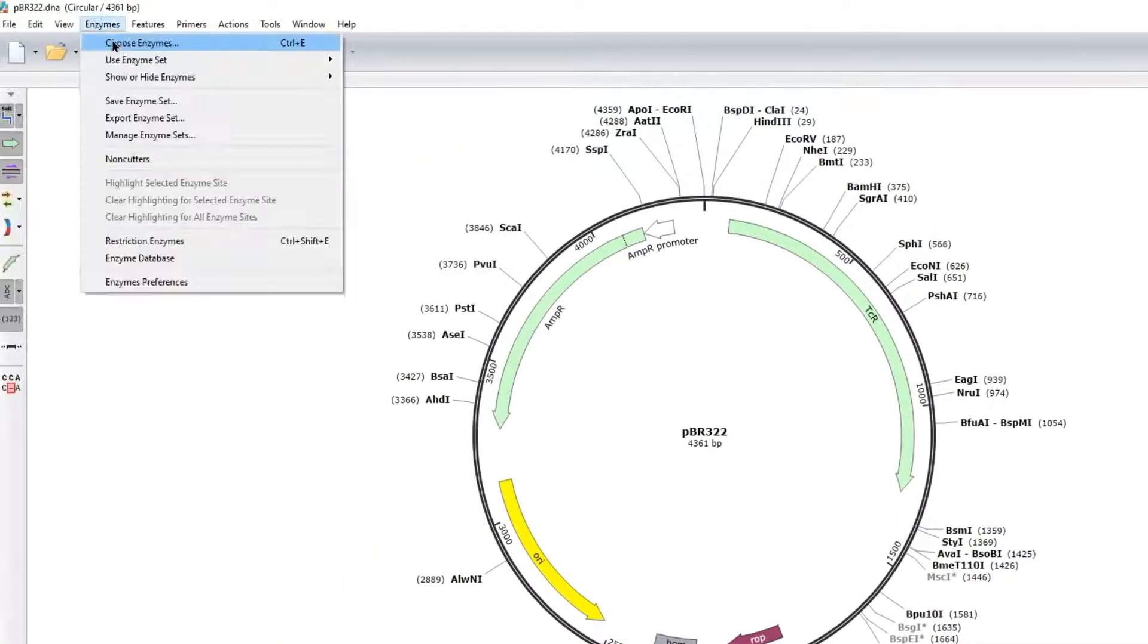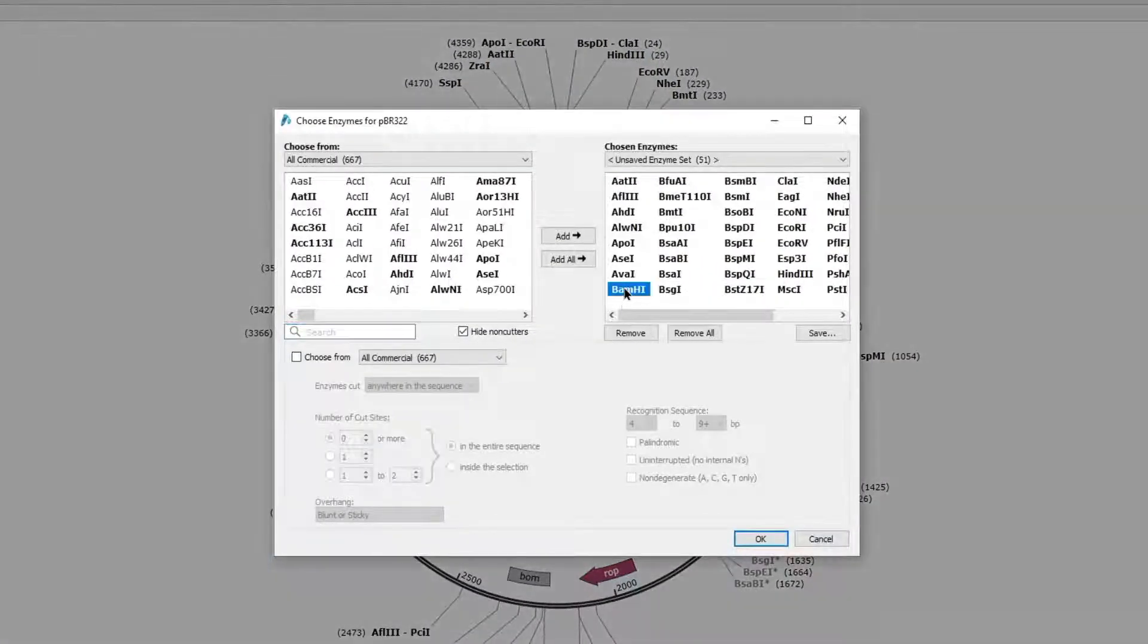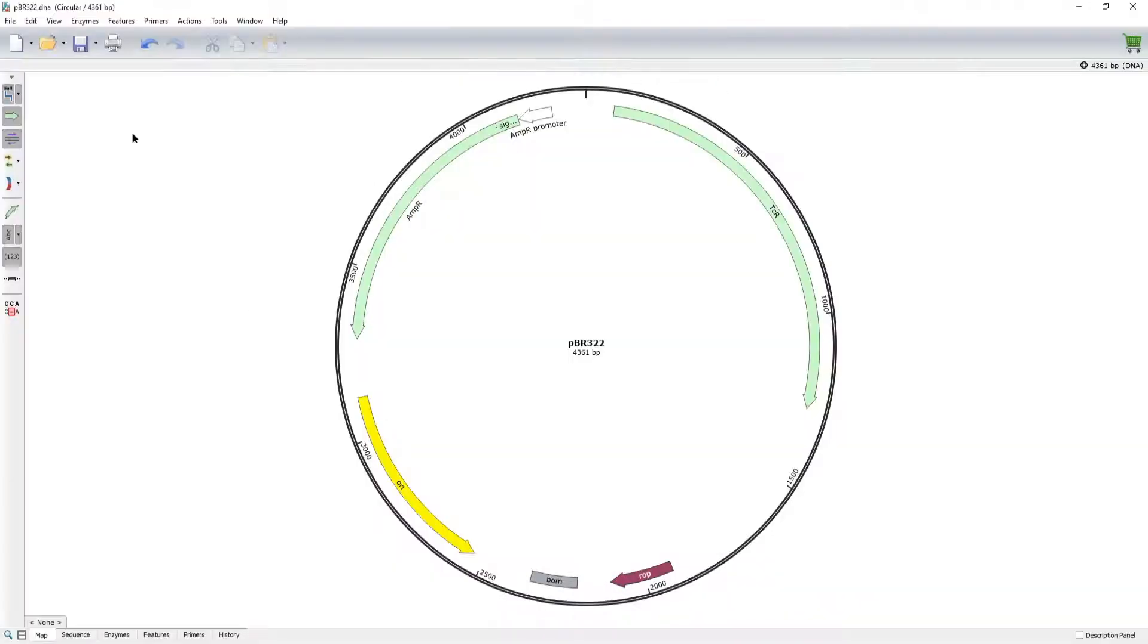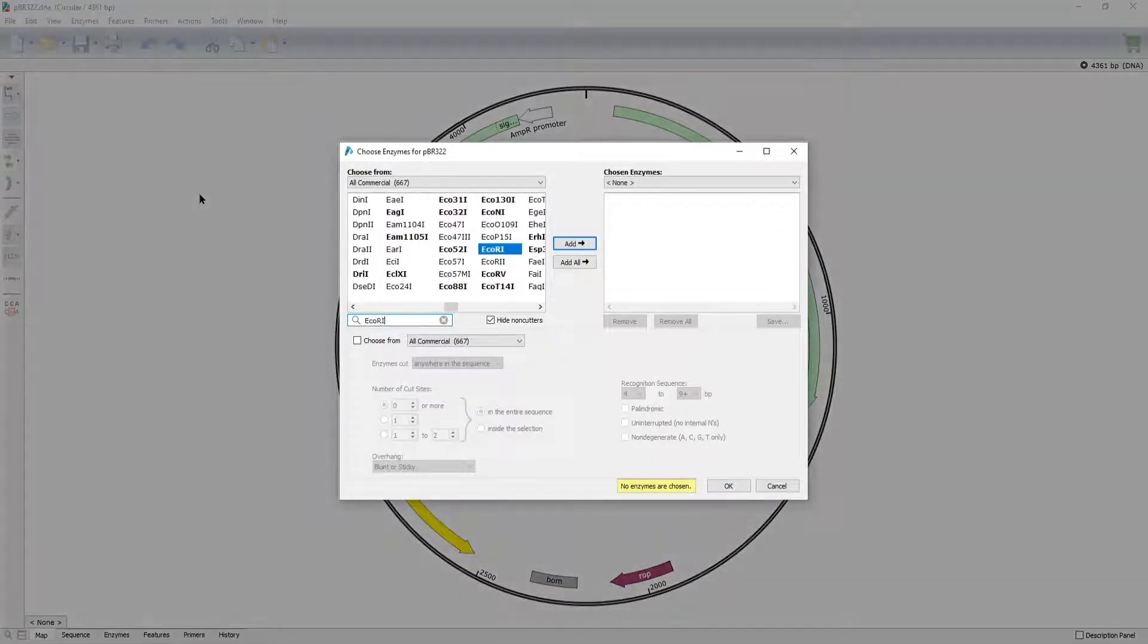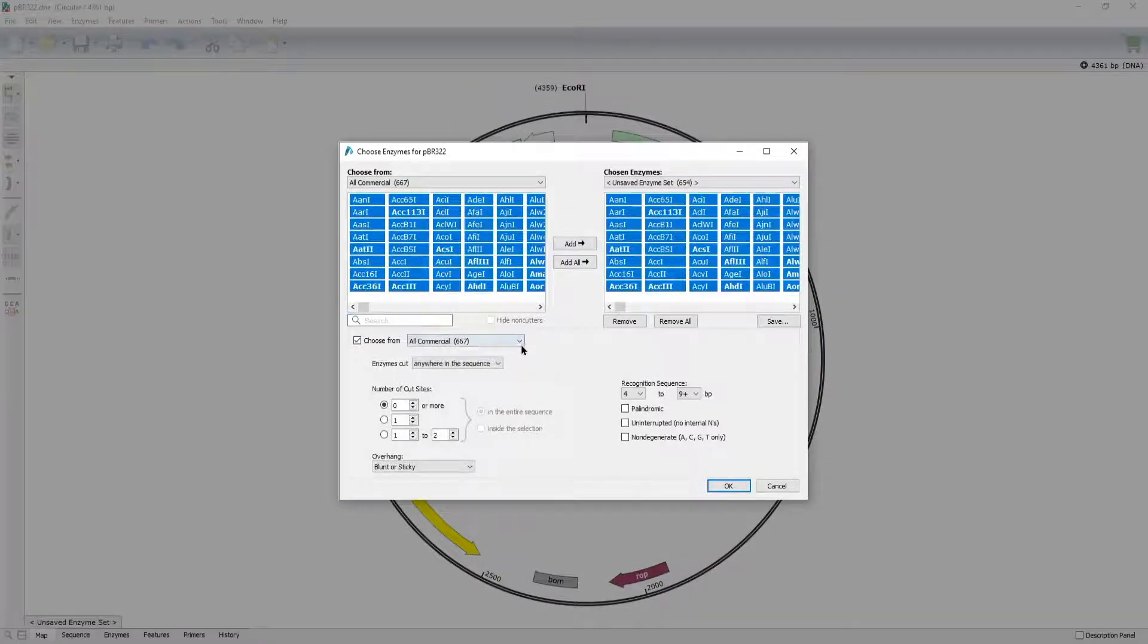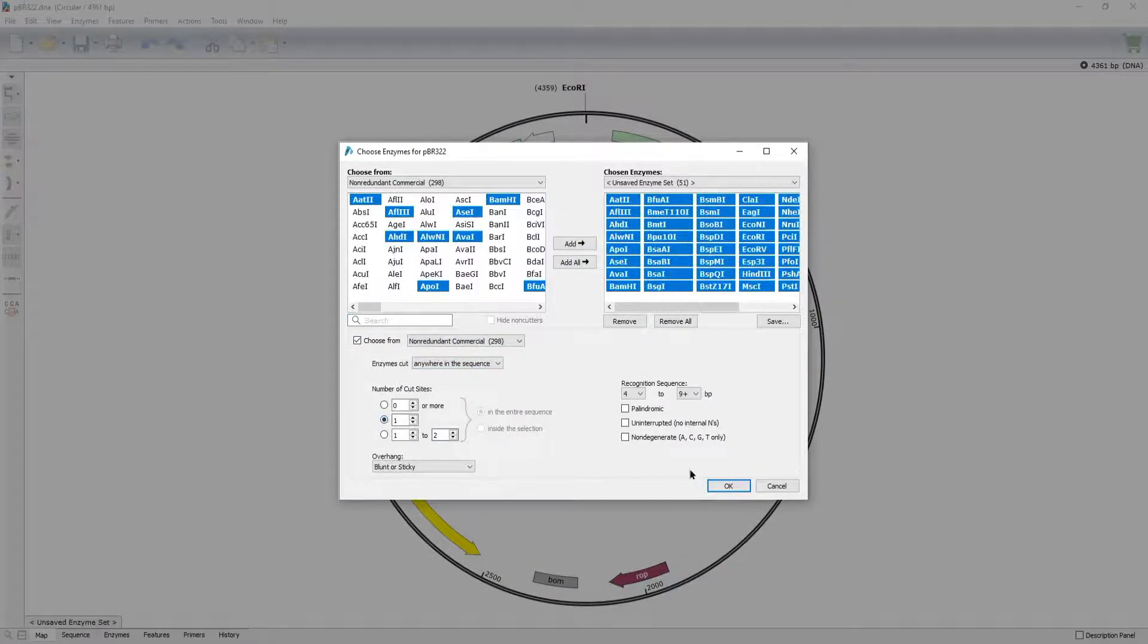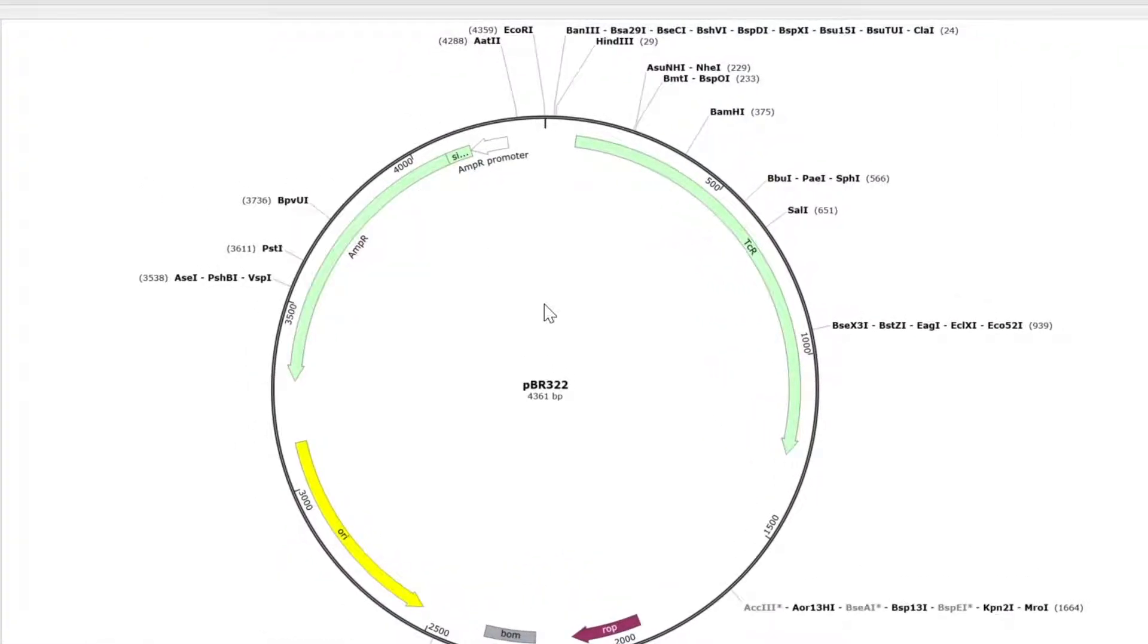SnapGene allows you to remove enzymes manually, either one at a time or all at once. To add individual enzymes, use the search field or filter by enzyme set. Keyboard shortcuts allow you to remove enzymes directly from the plasmid map.